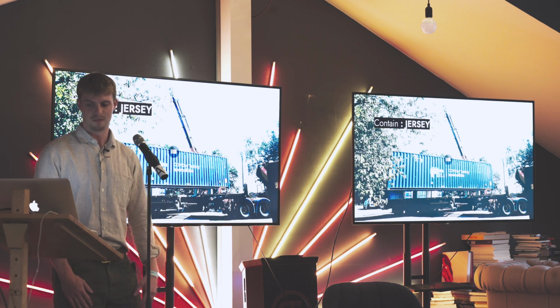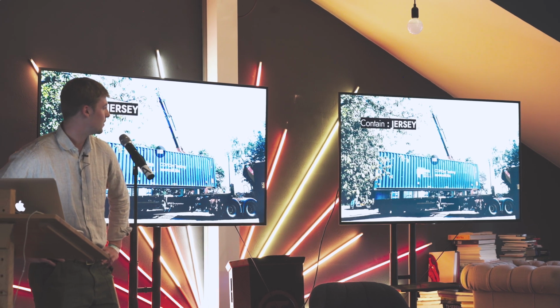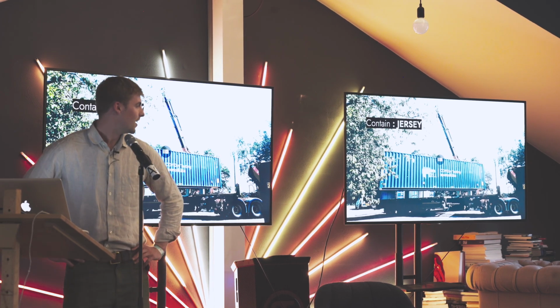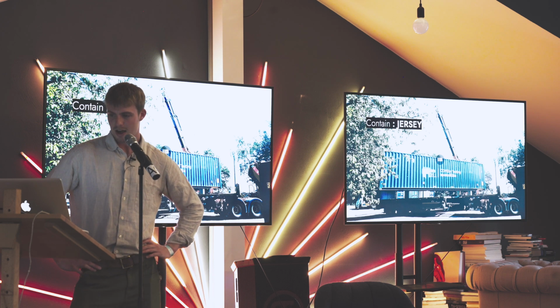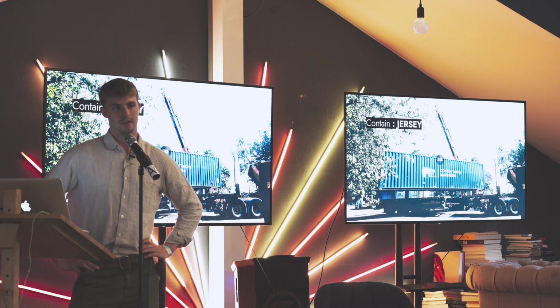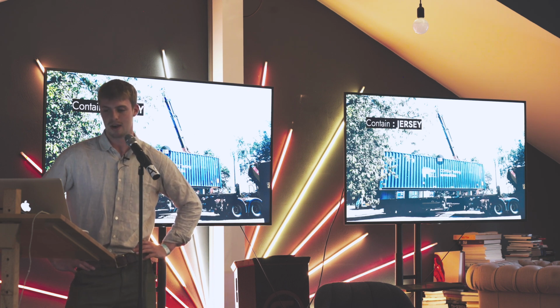They're also a great disguise. If you're an evil mastermind, there's no way that you're going to be found out that there's a laboratory in a shipping container. But yeah, they were born out of this need for COVID laboratories, and they could be taken anywhere you want.